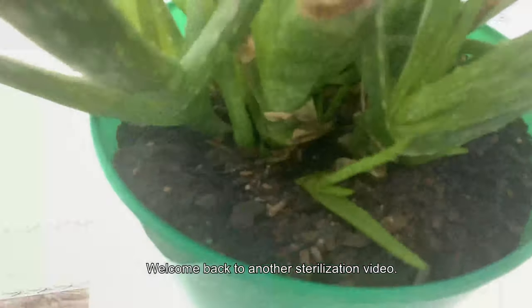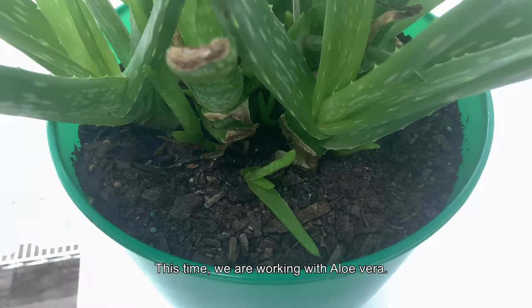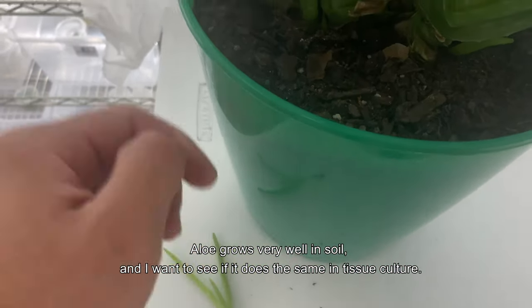What is going on guys, welcome back to another sterilization video. This time we are working with aloe vera. Aloe grows very well in soil and I want to see if it does the same in tissue culture.